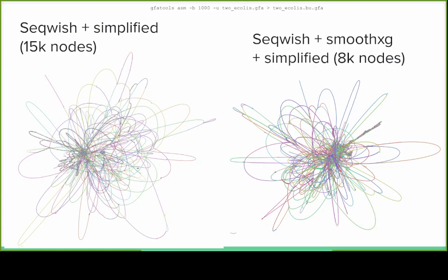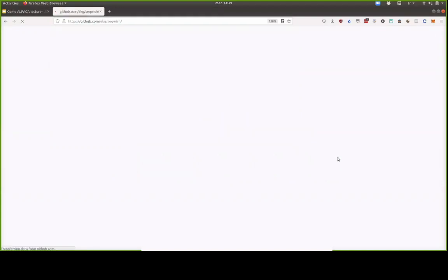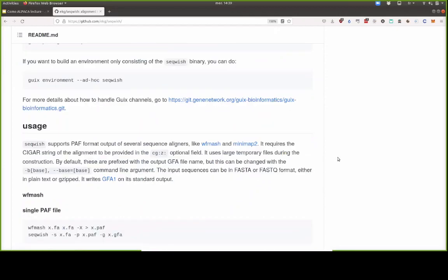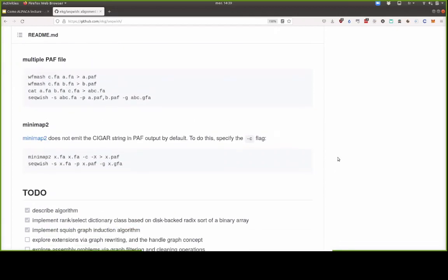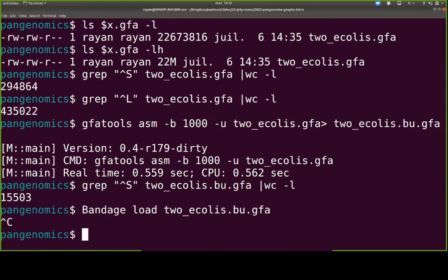Of course, you can get a lot of different kinds of graph in Seqwish, depending on the parameters you use. Oh, that's great info. I used the defaults. What should I have used? I don't know. Nobody really knows; it's by experimenting with it. There's a value of k in Seqwish. Yes, the segment size.